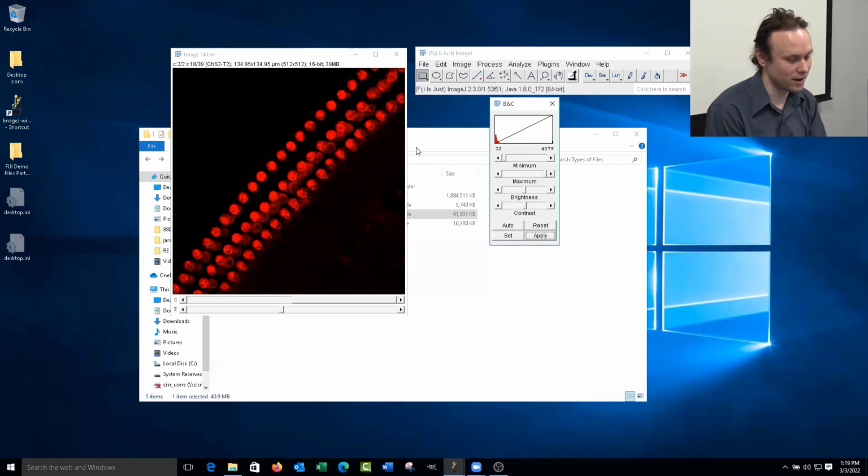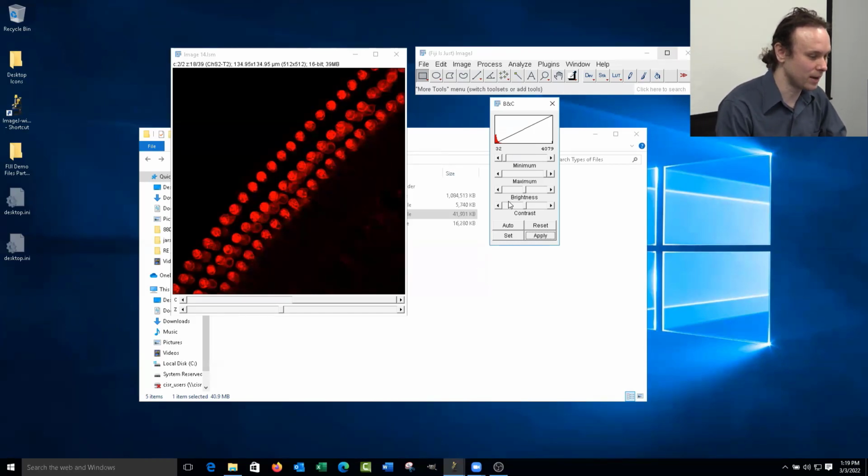So yes, you should absolutely change them all equally. It would be dishonest to change some a different way. The only exception I can think of is if you acquired your data not using all the same settings, which in itself is a bad thing to do. But yes, you should apply these settings equally.